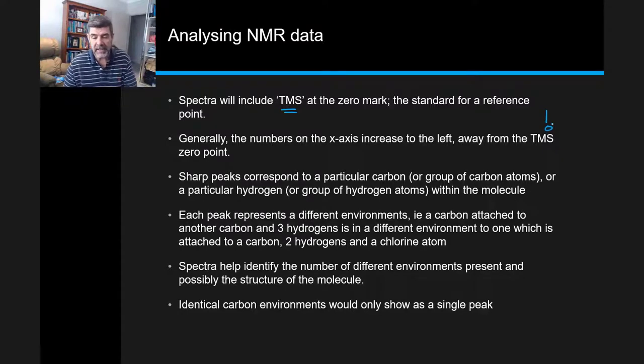What happens then is the numbers will move away from that zero mark to the left on the x-axis, and the sharp peaks will correspond to particular carbons or hydrogens within the molecule.